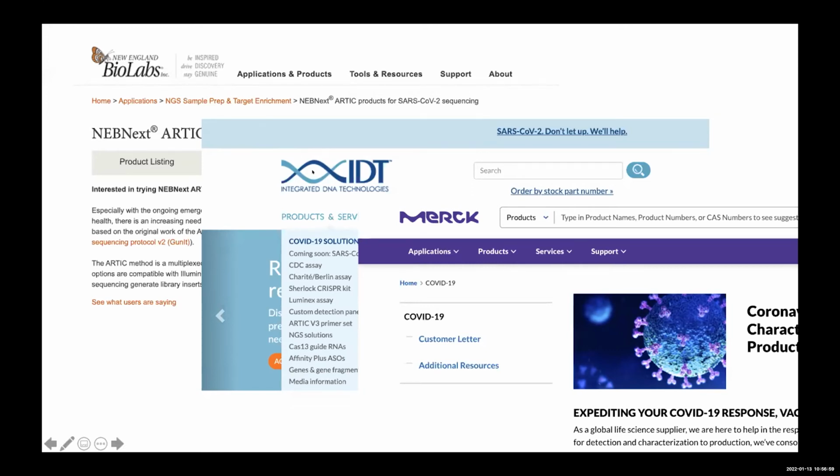Notably New England Biolabs, IDT, and Sigma, and it just wouldn't have been possible without having a large oligo manufacturer working with us, because this is a popular protocol with hundreds of labs using this. If every single person had to order oligos, it would be a large amount of work for individual labs, with much more variability and duplicate synthesis going on.